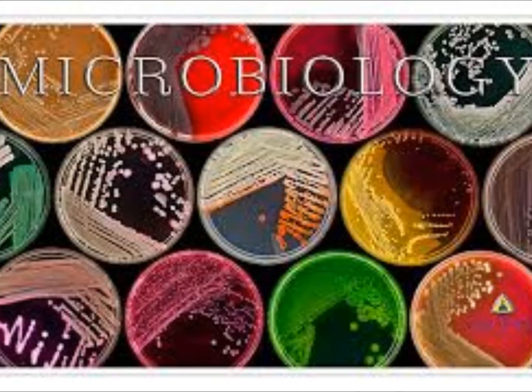Smooth, well, a smooth colony is just like it says, there's not a whole lot of texture to it. If it's rough, you'll see colonies that look kind of bumpy, and when you go to pick them up, they kind of crumble. They can be dry, which again, the dry ones will crumble.